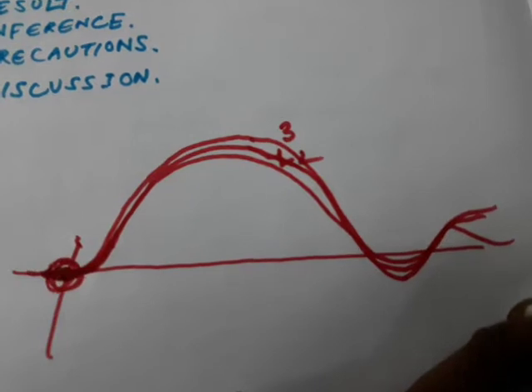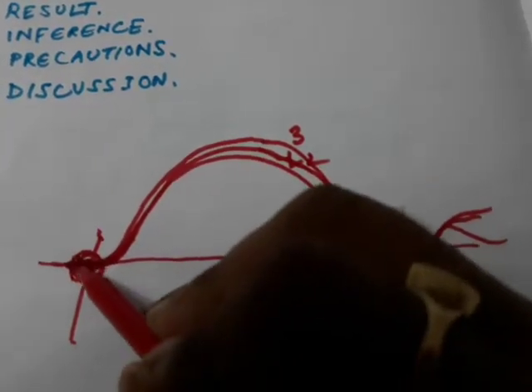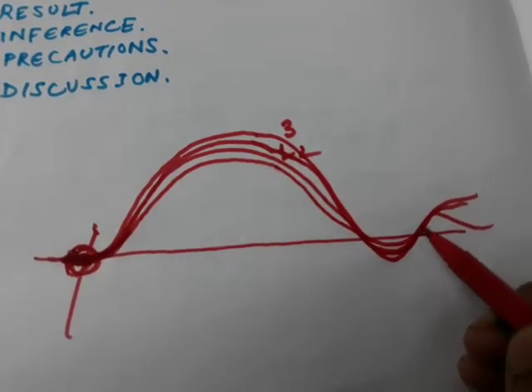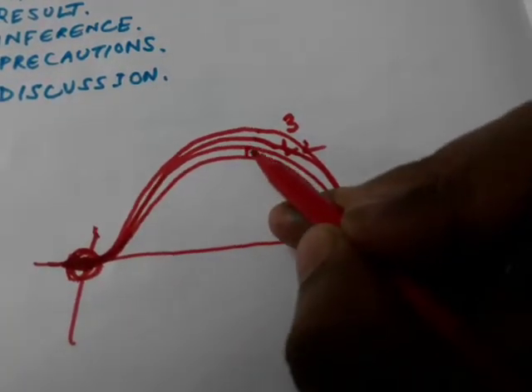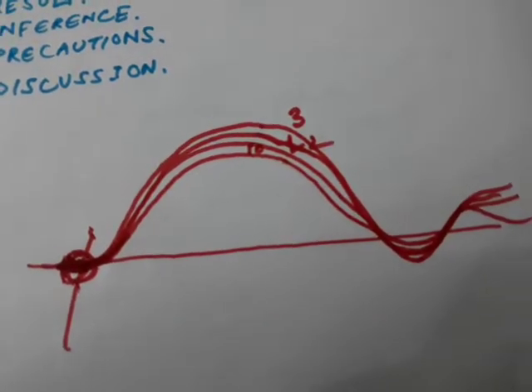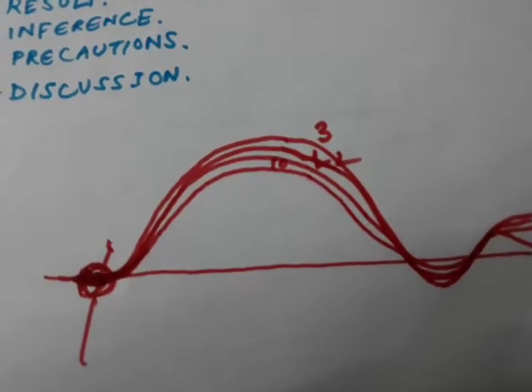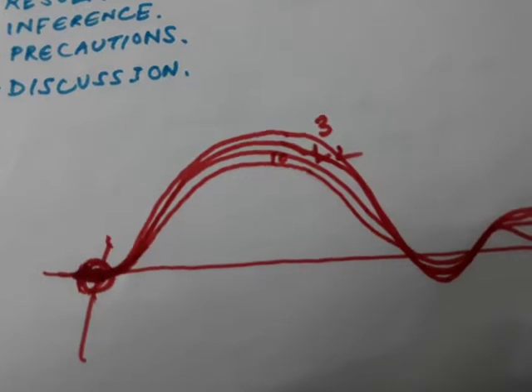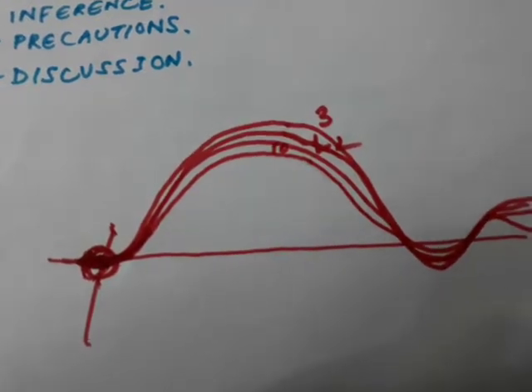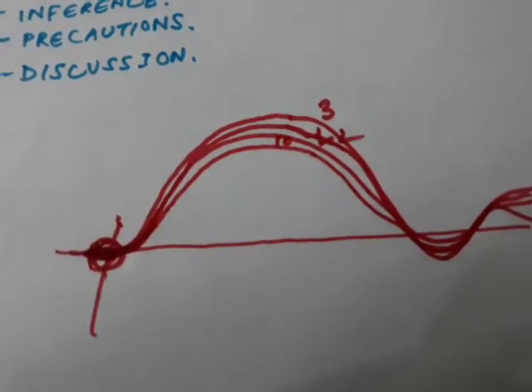For the 10th one, we again reapply the writing point to the drum and then stimulate the nerve. It should give a curve like this. This is the 10th one. Now 11, 12, 13, 14, 15, 16, 17, 18, 19 we will not record. That is, we will record only every 10th contraction by applying the writing lever to the drum. This should be done till the muscle contractions are too weak to be recorded. Only every 10th contraction is taken to prevent the overlap of responses.